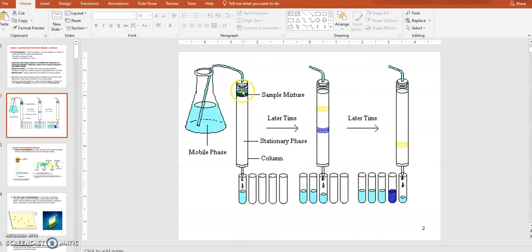So if you're looking at the column chromatography, here's the column that contains resin. So your mixture of molecules is introduced through the mobile phase that's moving through your stationary phase, the column. So in this case, there is no pump. It's just a gravity pull that's going to continuously move your buffer through the column. Okay, but based on the difference among these molecules' interaction with the medium, the resin, they will have different speeds in terms of their traveling through the medium. Okay, so the molecules will be separated out on a medium continuously. So if you collect those things that are coming out from the column, different fractions, meaning in separated small volumes, you will see different molecules are contained in different fractions. That is basically the separation principle that applies here.